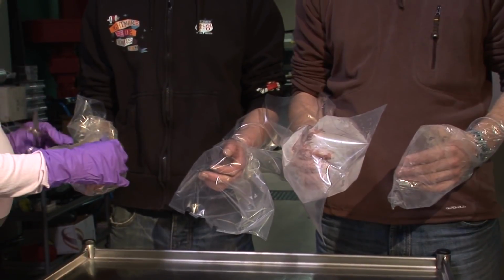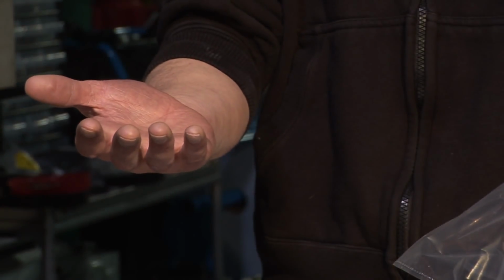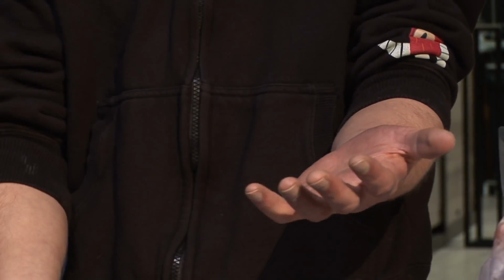I'm also looking at what I can learn from fingerprints, and I've found that we can actually pick up molecules from specific brands of different hair gels and different soaps, for example. So what I want you to do is use your index finger and rub it down your nose and then down your left cheek and your right cheek. Awesome. Rub the fingertips together.